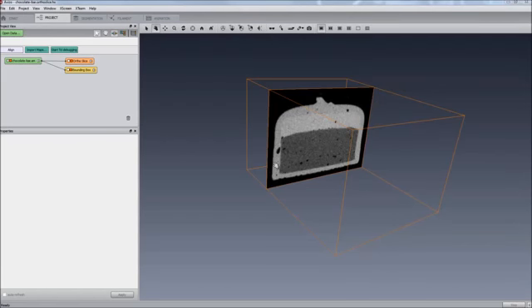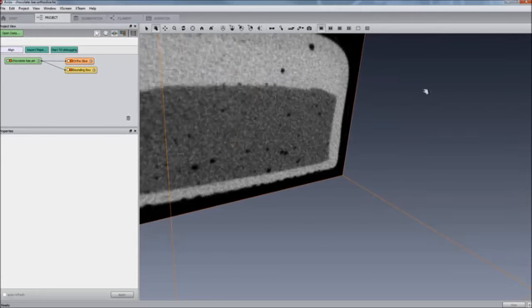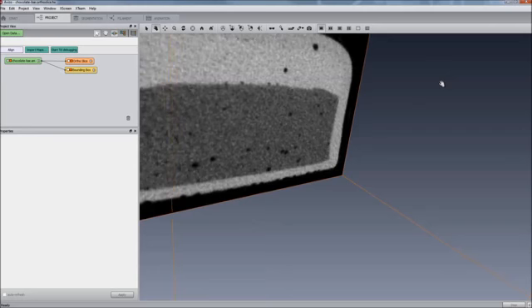The Target button, called Seek, helps focus on a specific part of an object. When it is clicked, the mouse cursor is temporarily changed to a target. When clicking on a specific point on the object, the selected point becomes the new center of the scene. This point is also the new center of rotation for the trackball viewing mode.